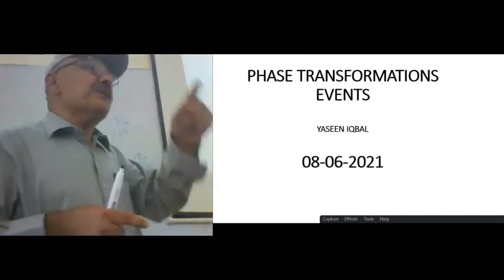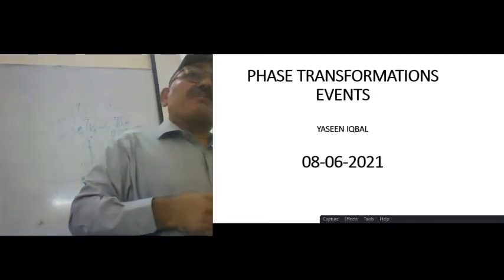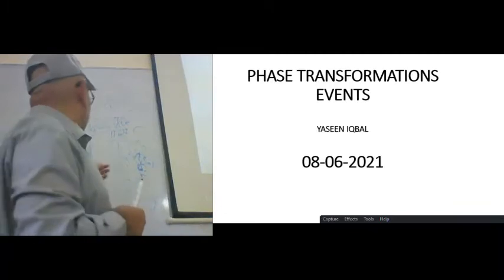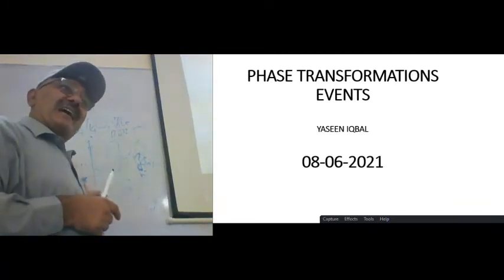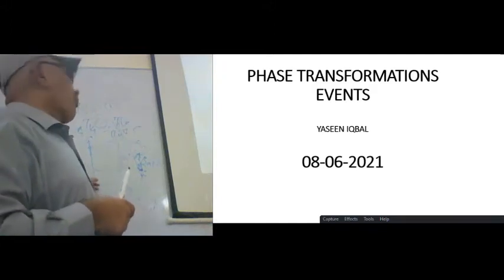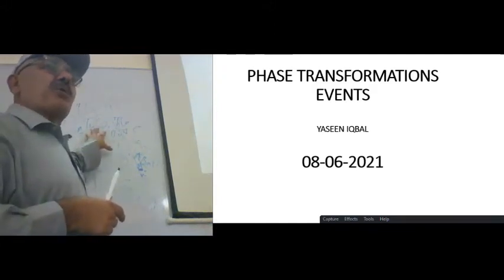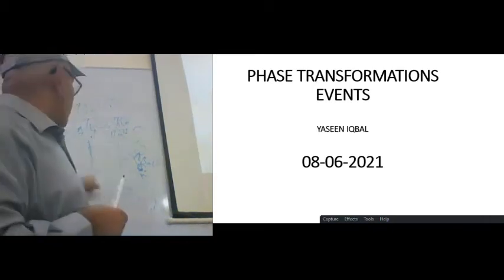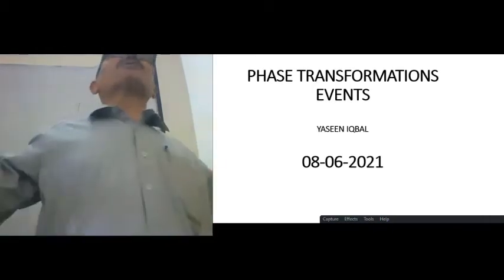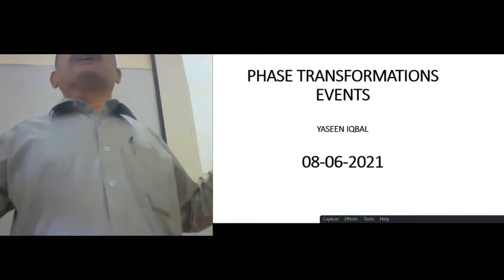So if you need a large number of small crystals, then the ideal way is to heat the material here. If you need quicker crystallization of the whole volume, then the ideal way is this. So this peak tells you a lot about the material.